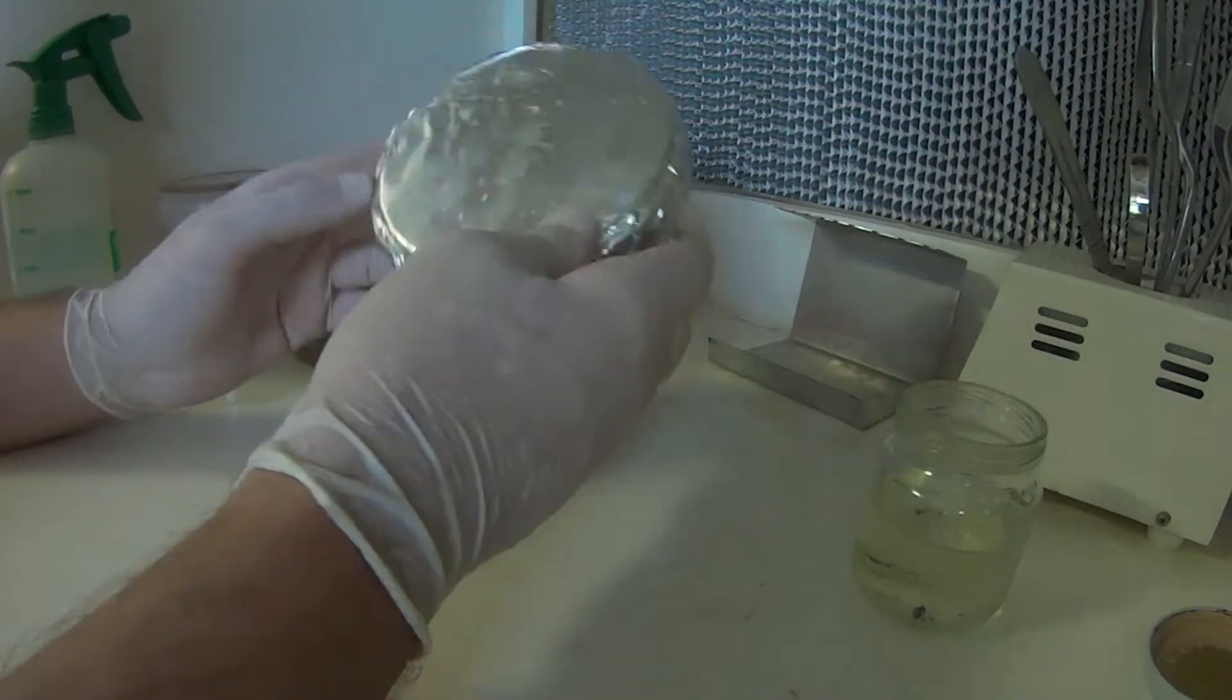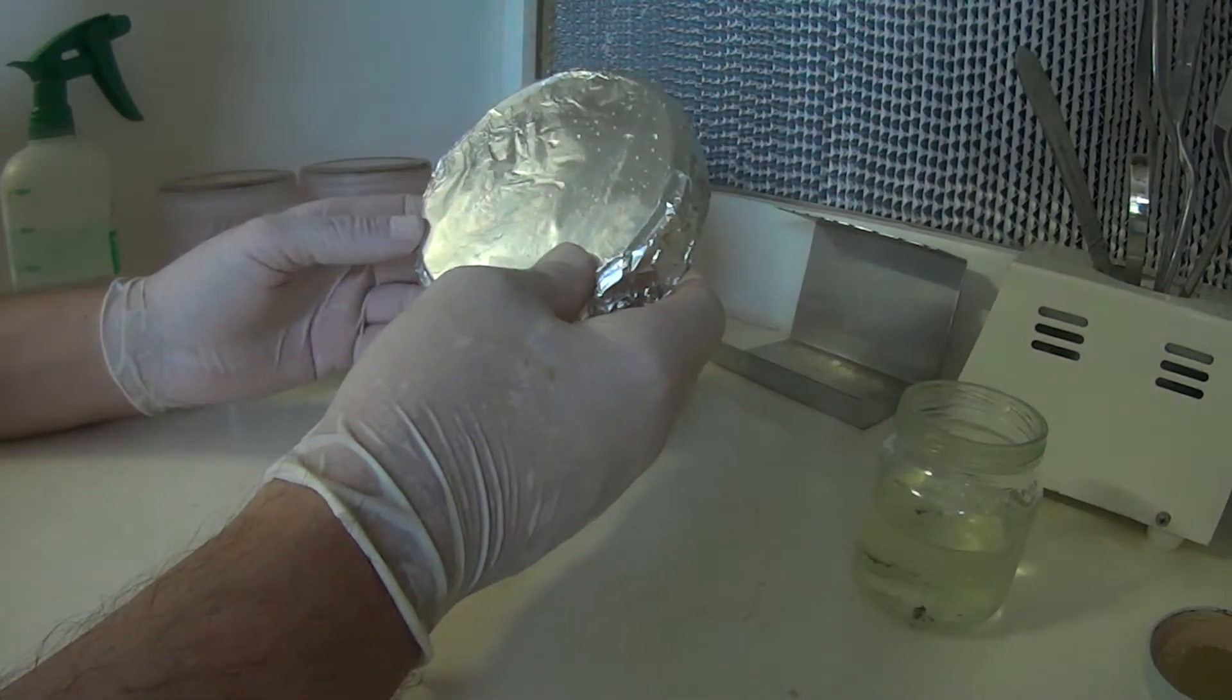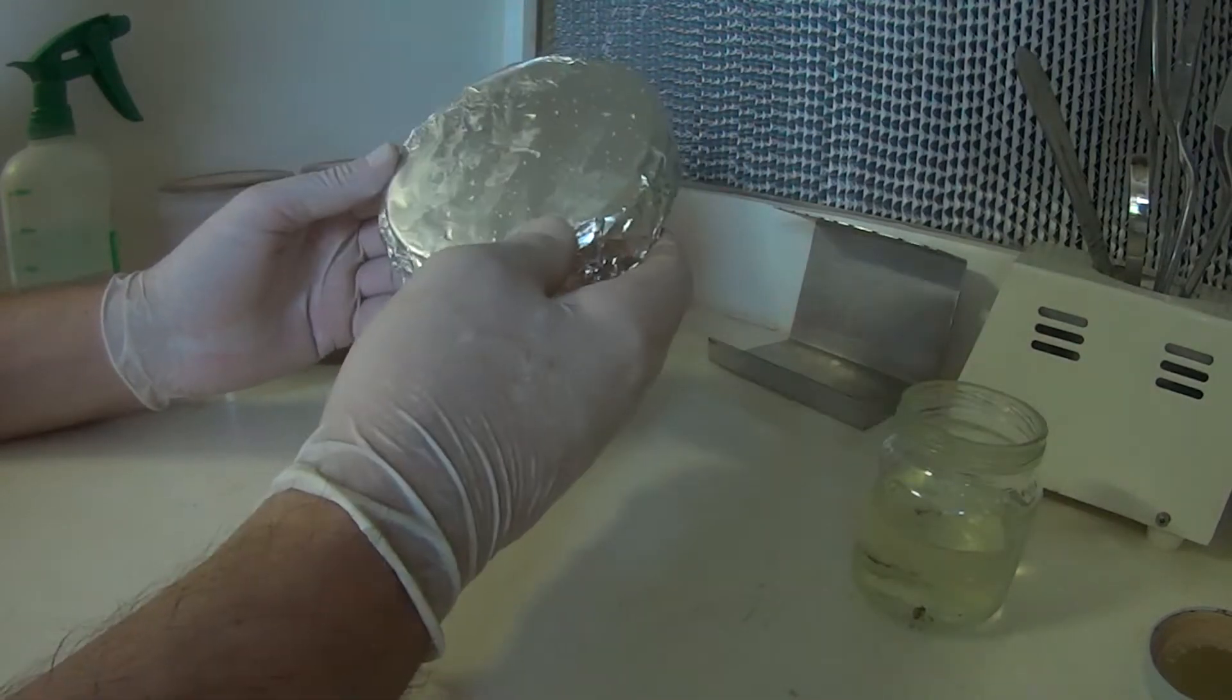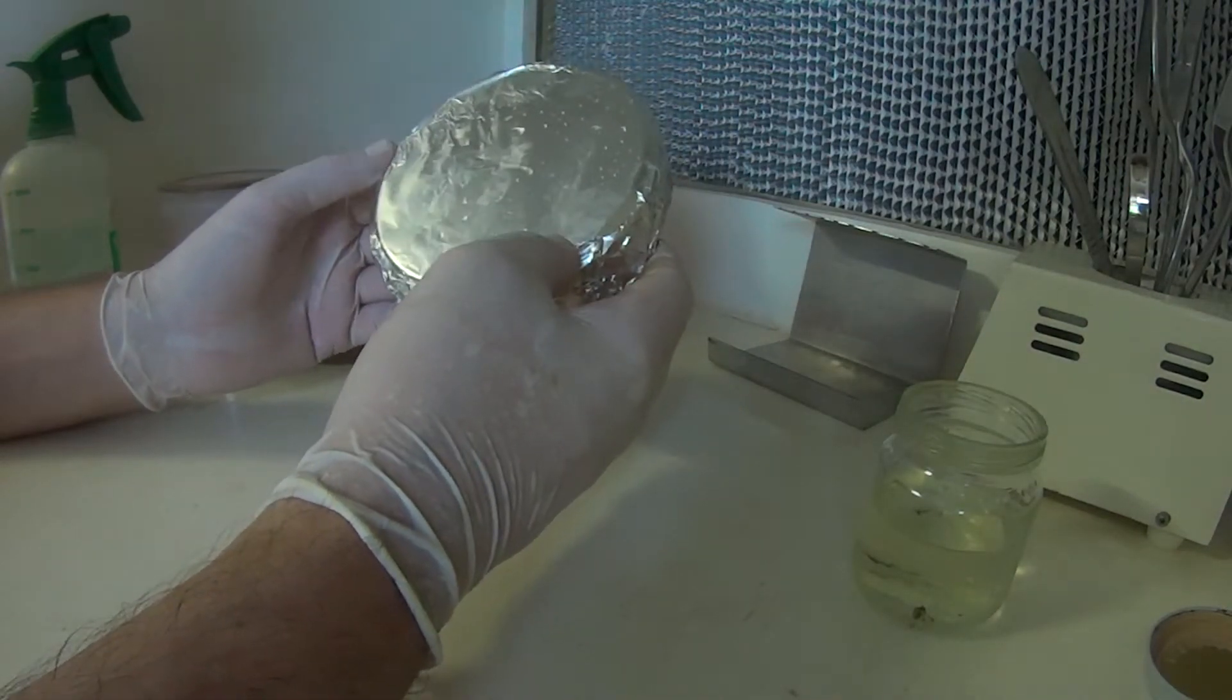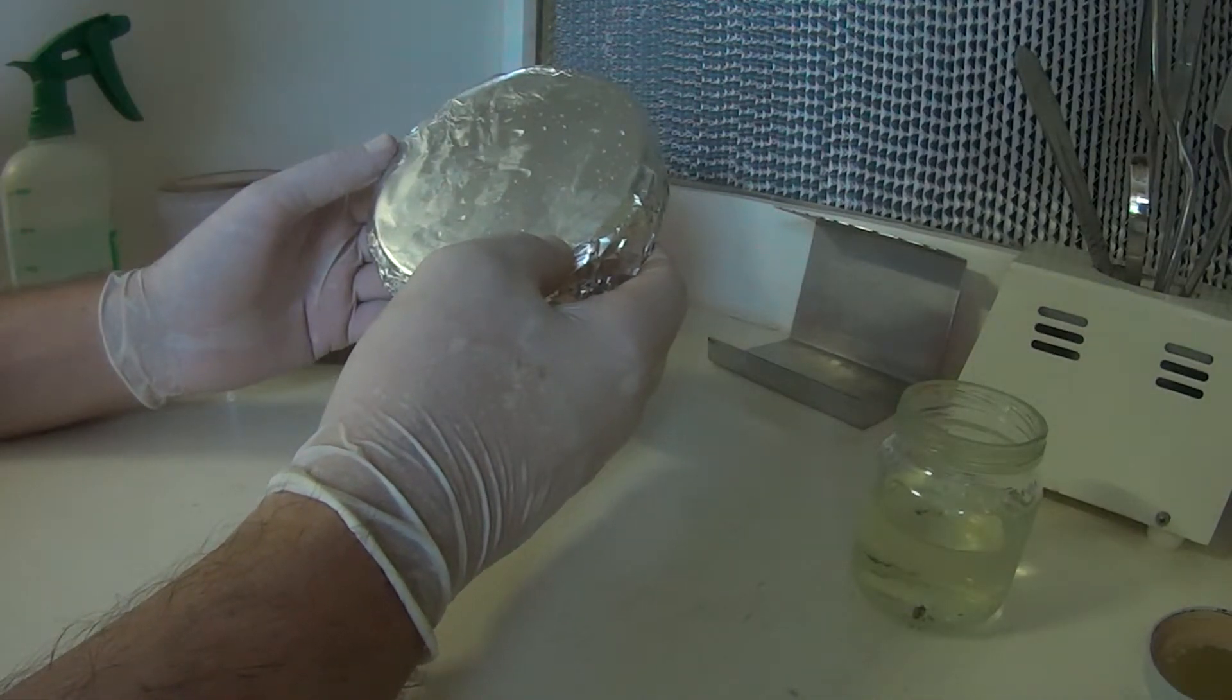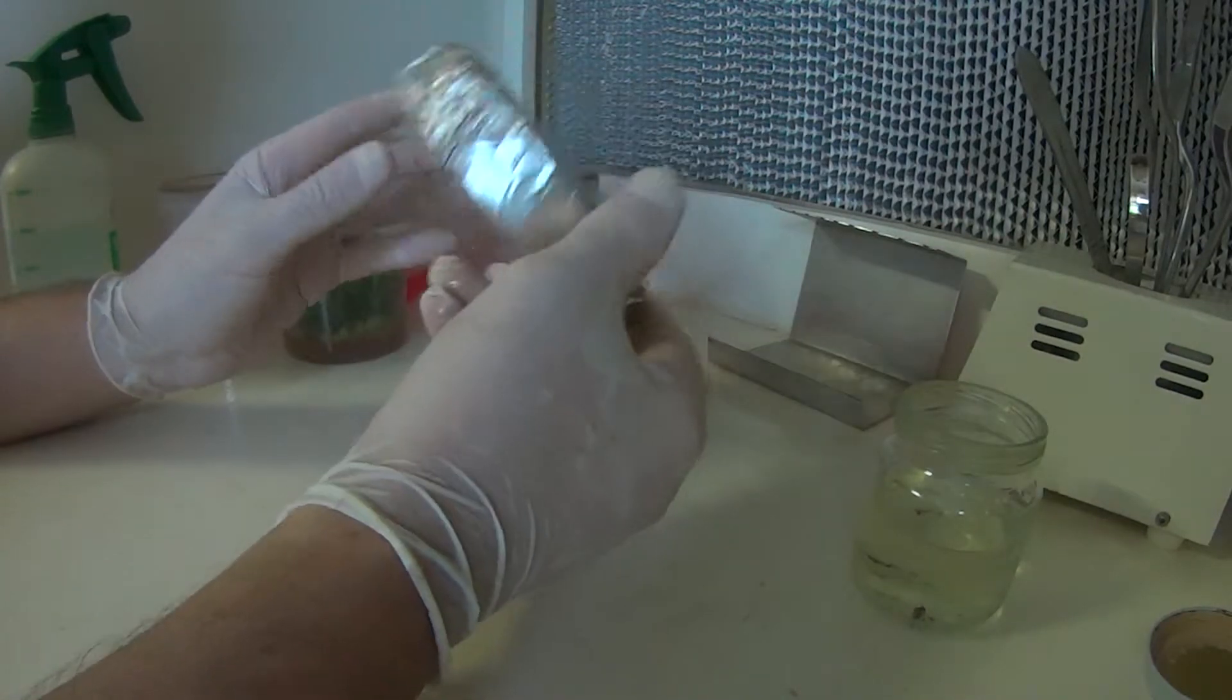This is just a petri dish wrapped up in aluminum foil. Clean the dish, wrap it up in foil and then stick it in the oven and cook it at around about 200 degrees Celsius for half an hour. Let it cool down and it's all wrapped up, so the dish is sterilized inside.